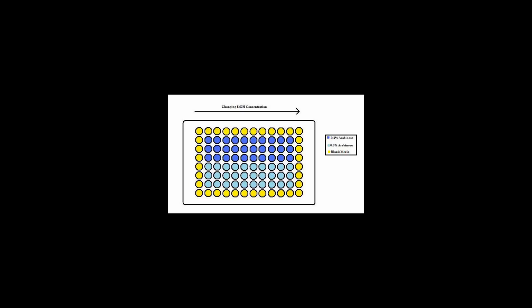Fluorescence polarization. Fluorescence polarization measurement is also very close to FI detection. The difference is that the optical system includes polarizing filters on the light path. The samples in the microplate are excited using polarized light, instead of non-polarized light as in FI and TRF modes.